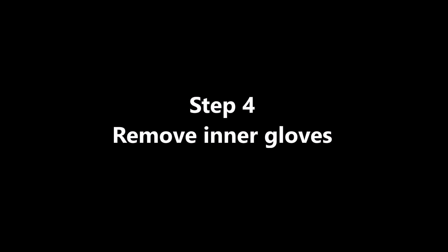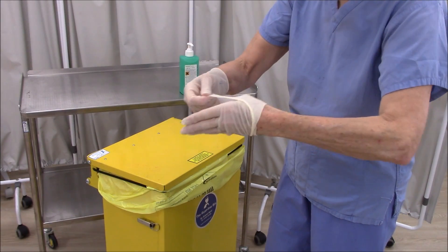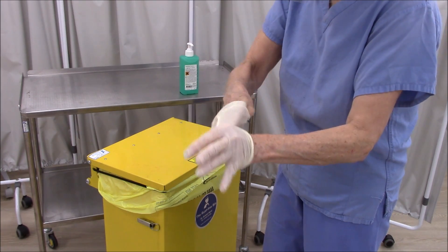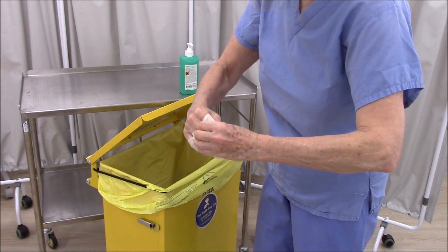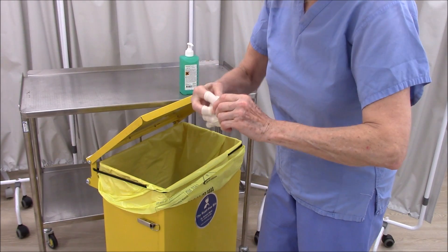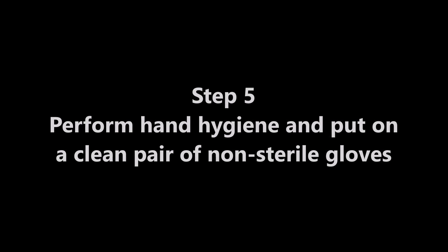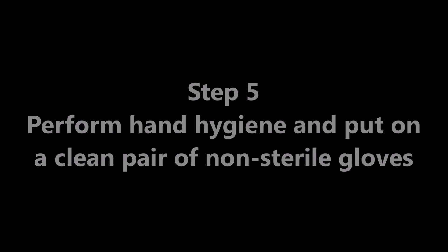Remove inner gloves, taking care not to contaminate bare hands during the removal process. Put on a clean pair of non-sterile gloves.